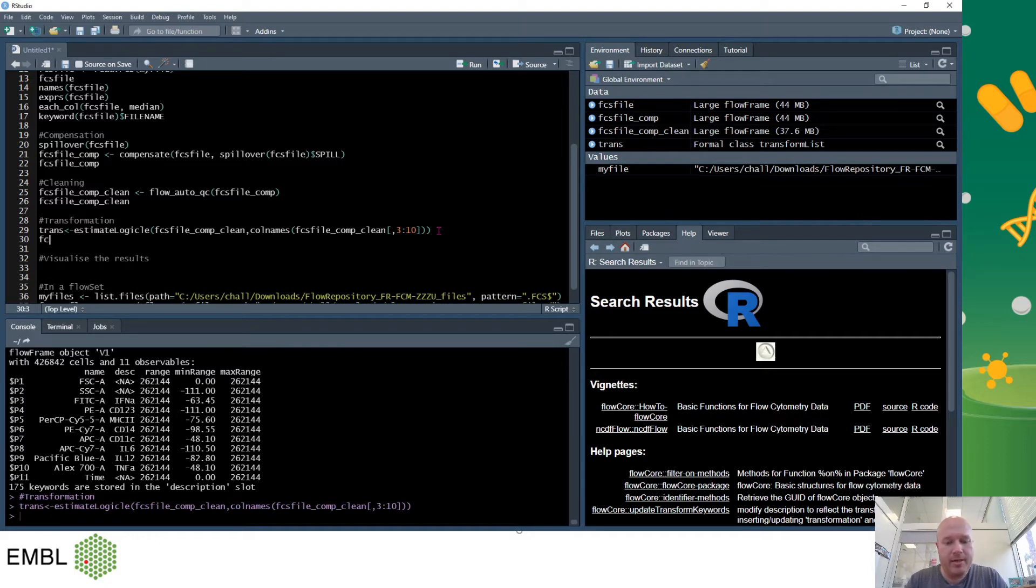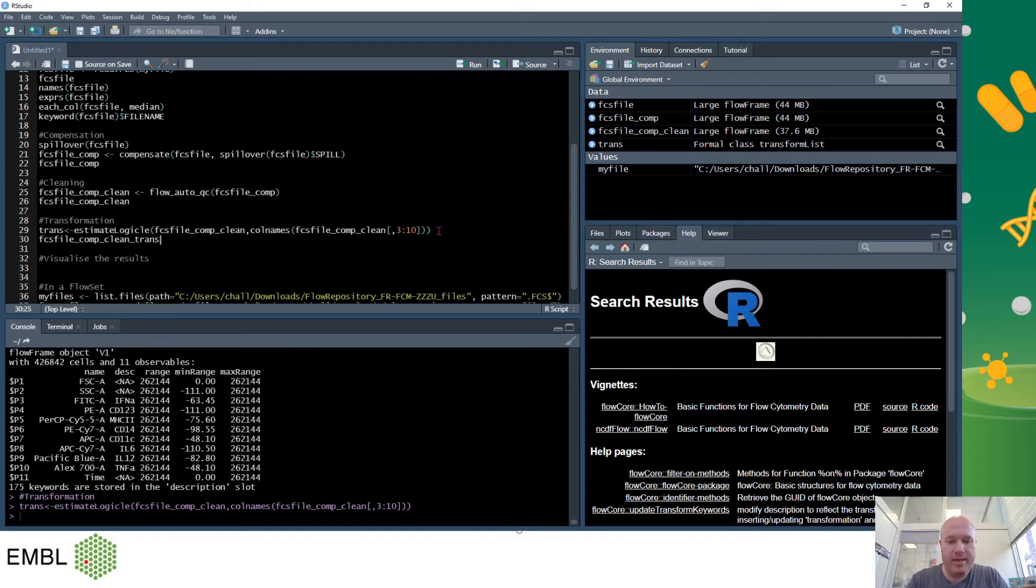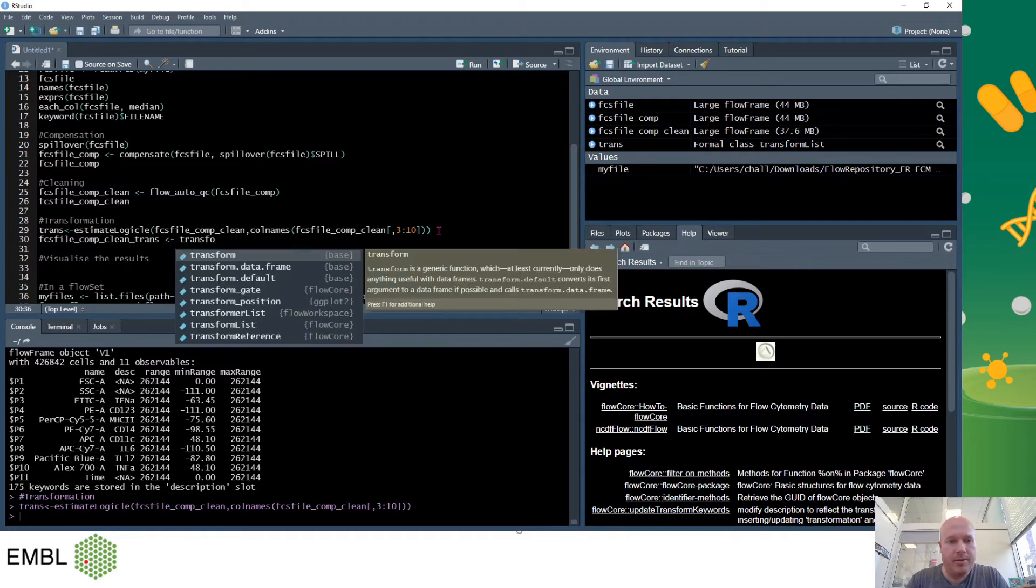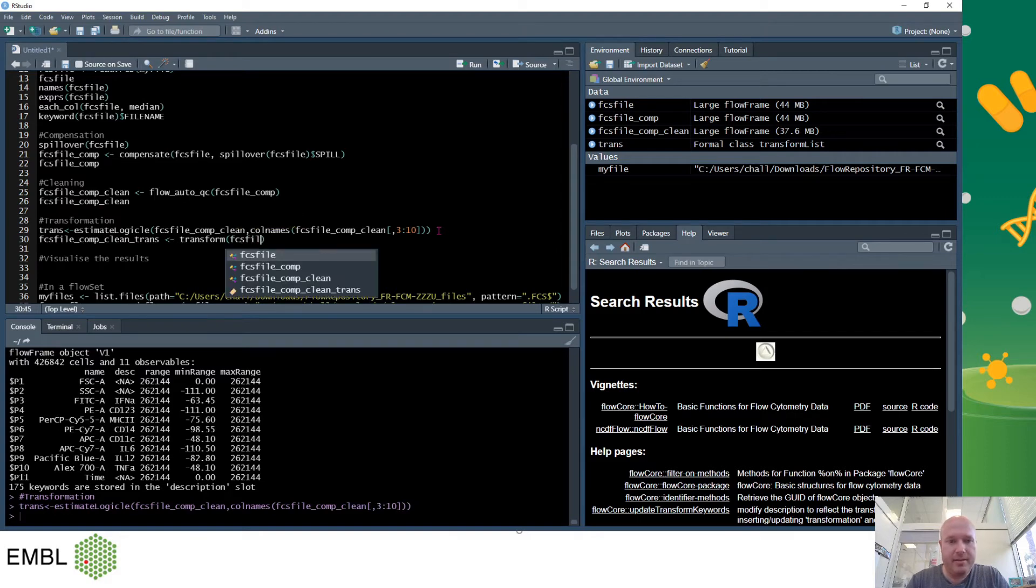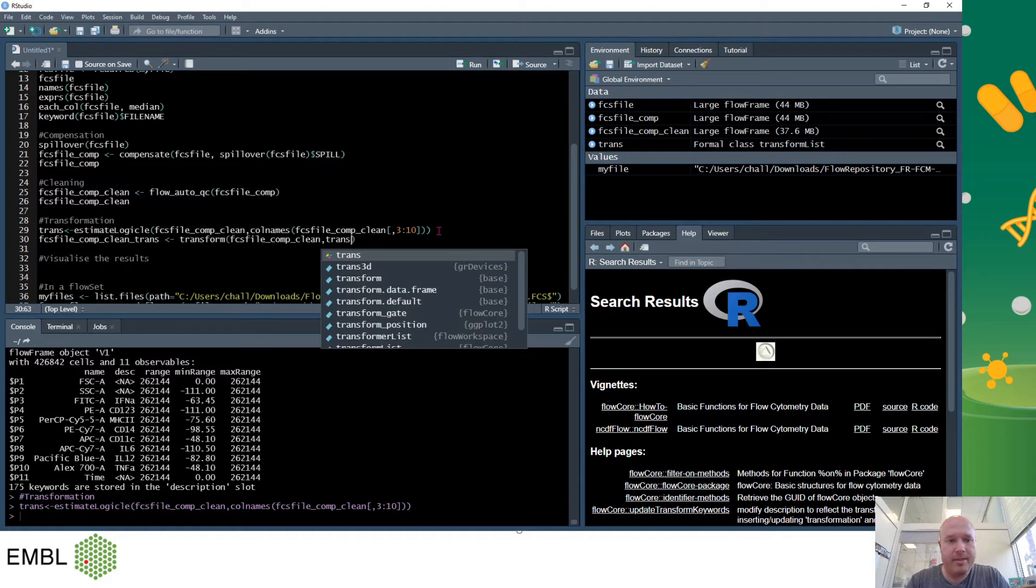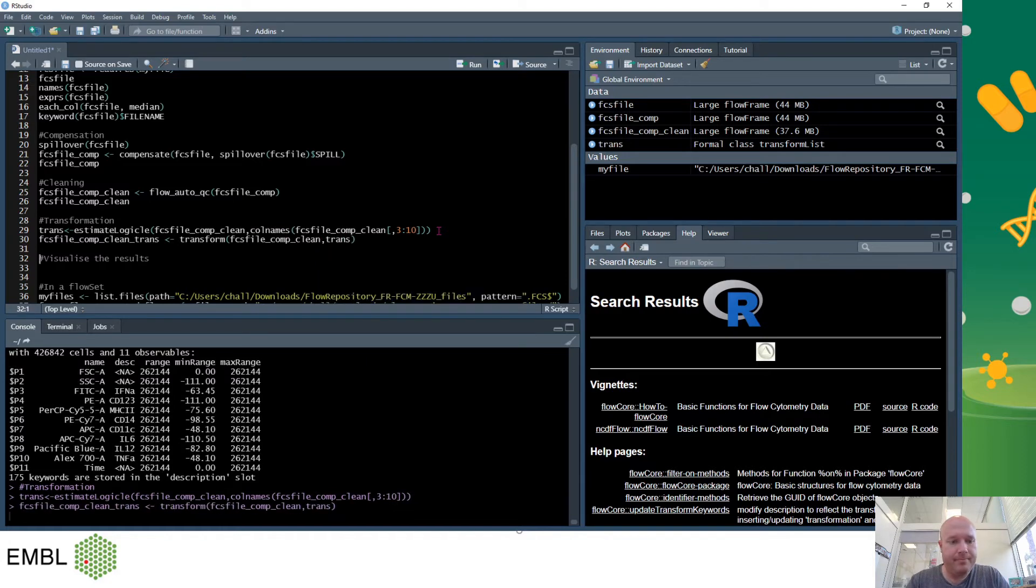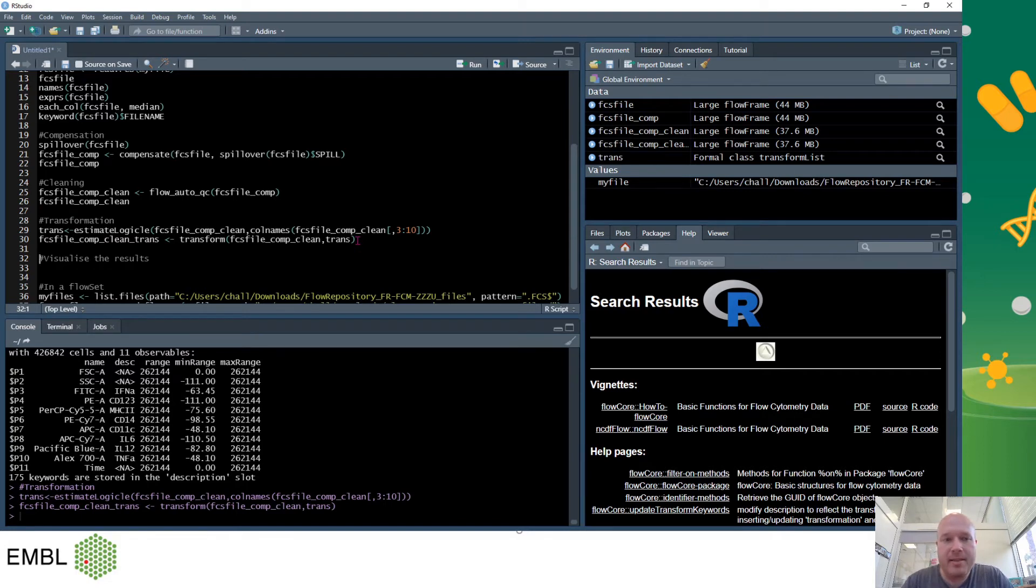So now I make a new FCS file variable. We'll call this, we add trans to this, and then I want to transform using transformation FCS file comp clean and using the transformation that we previously made. And that will transform the file so now we'll be able to visualize it and see the difference.